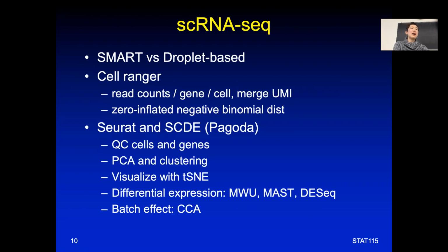Because most of the time, you want to visualize, you want to say, okay, in the blood, what are the major cell types? Oh, there are CD4 T cells, CD8, like basically with 100 dimensions, you should be able to separate most of these. And so you can do a PCA to get, say, the top 100 or even 10 dimensions. And then you want to use clustering. We looked at this before. You just look at the pairwise distance and try to find the tight clusters.